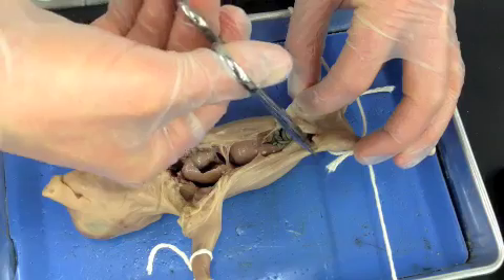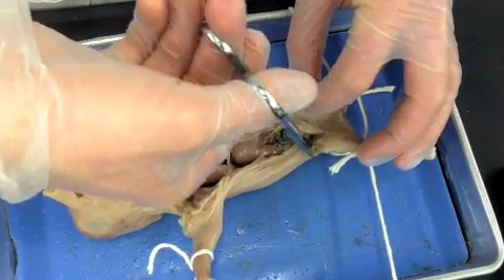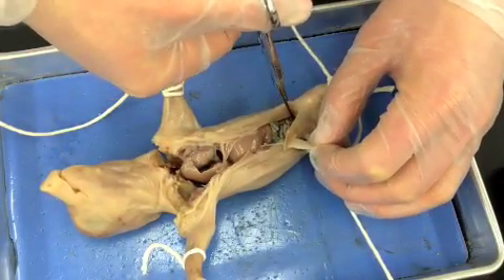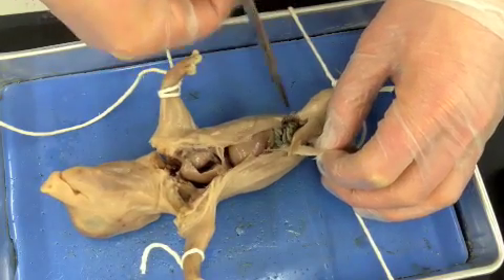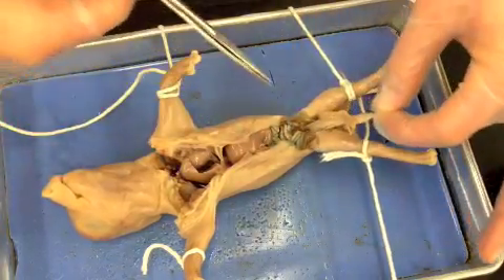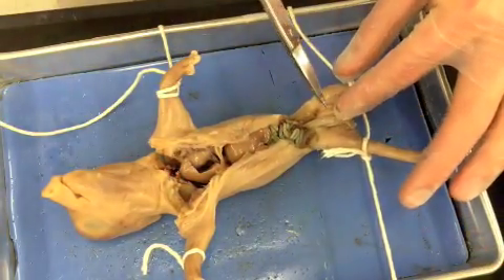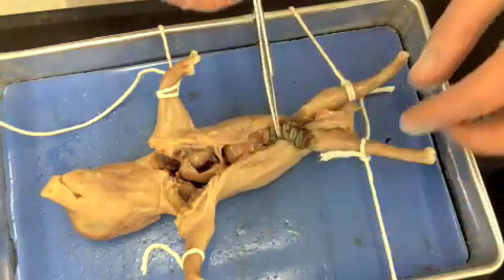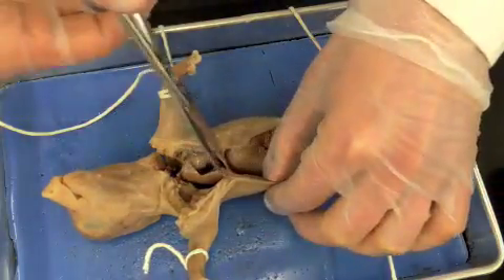I come down on the sides again, and when I feel ready, I snip and fold that back, exposing the urinary bladder, and we start to see the intestines — the large intestines here. I then come back up.